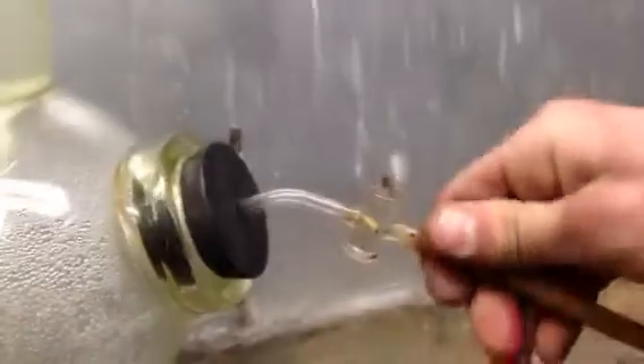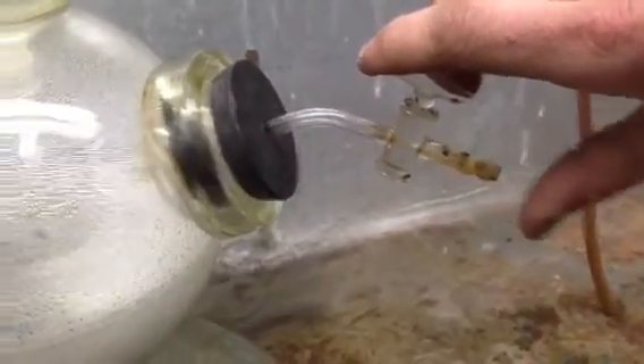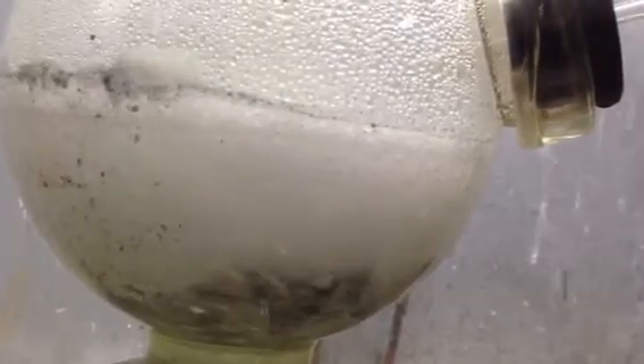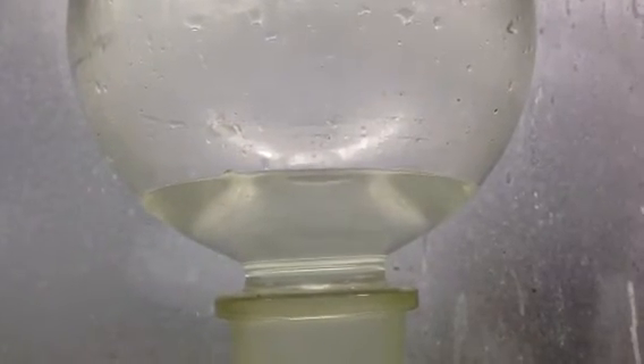Just to make it happen faster — when I close the valve, and that is how a Kipp's generator works.